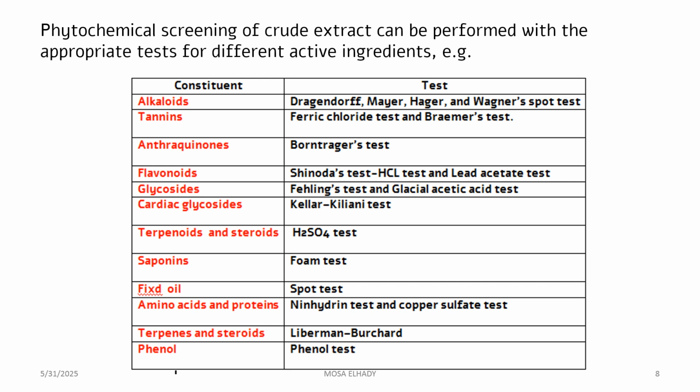We start with alkaloid. The most appropriate tests that can be used as general screening tools are Dragendorff's, Mayer's, Hager's, and Wagner's reagents. These are four types of reagents or tests that can be applied for the presence of alkaloid. This is used for phytochemical screening for alkaloids.